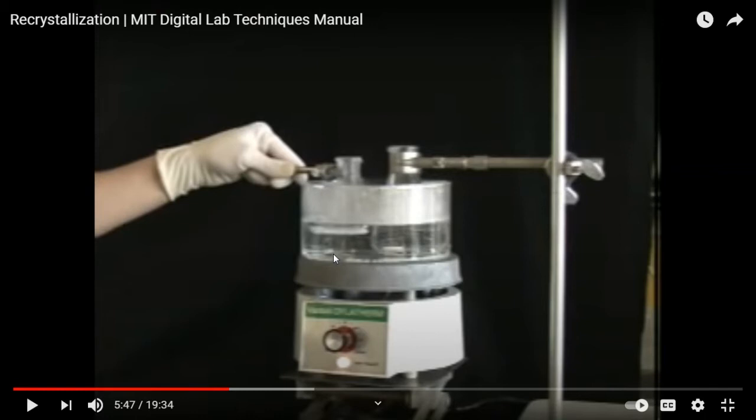If you don't check every time whether it is actually taking away some solid, then you are adding too much liquid. Why? The thing is not dissolving now. That thing can be maybe impurity. Because of the impurity, you did not check whether it's dissolving. You ended up having too much liquid. Then it's a problem for step 4. Thus, it is a big problem for the overall experiment outcome.